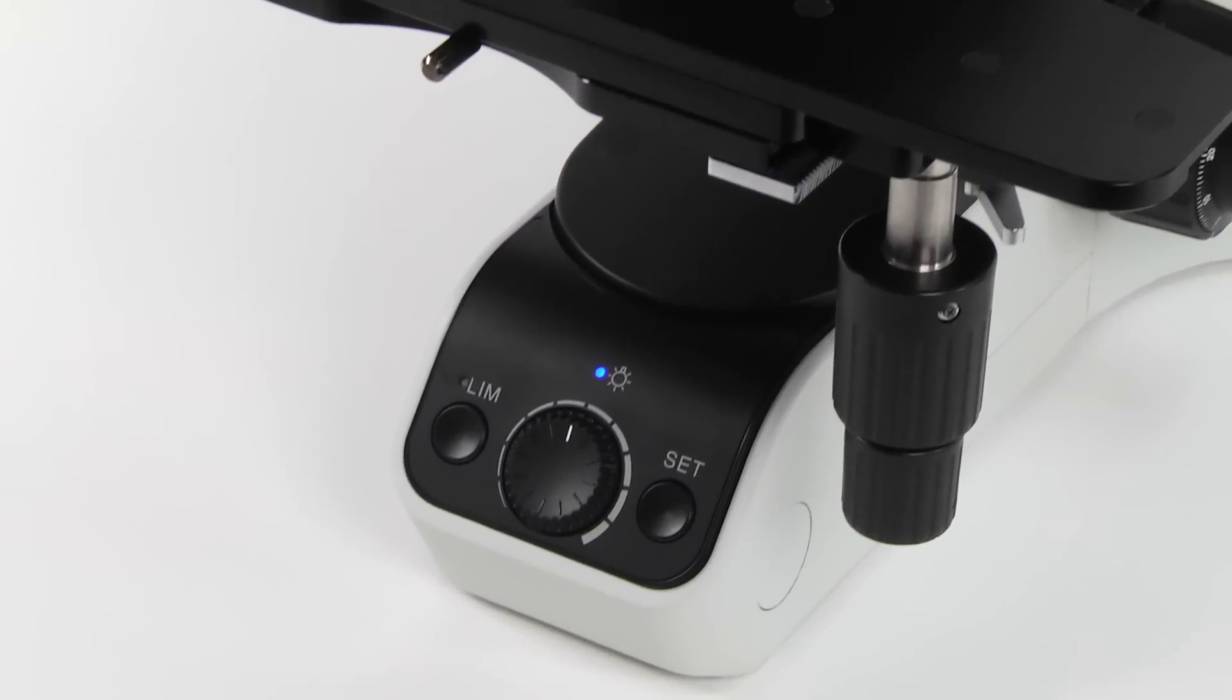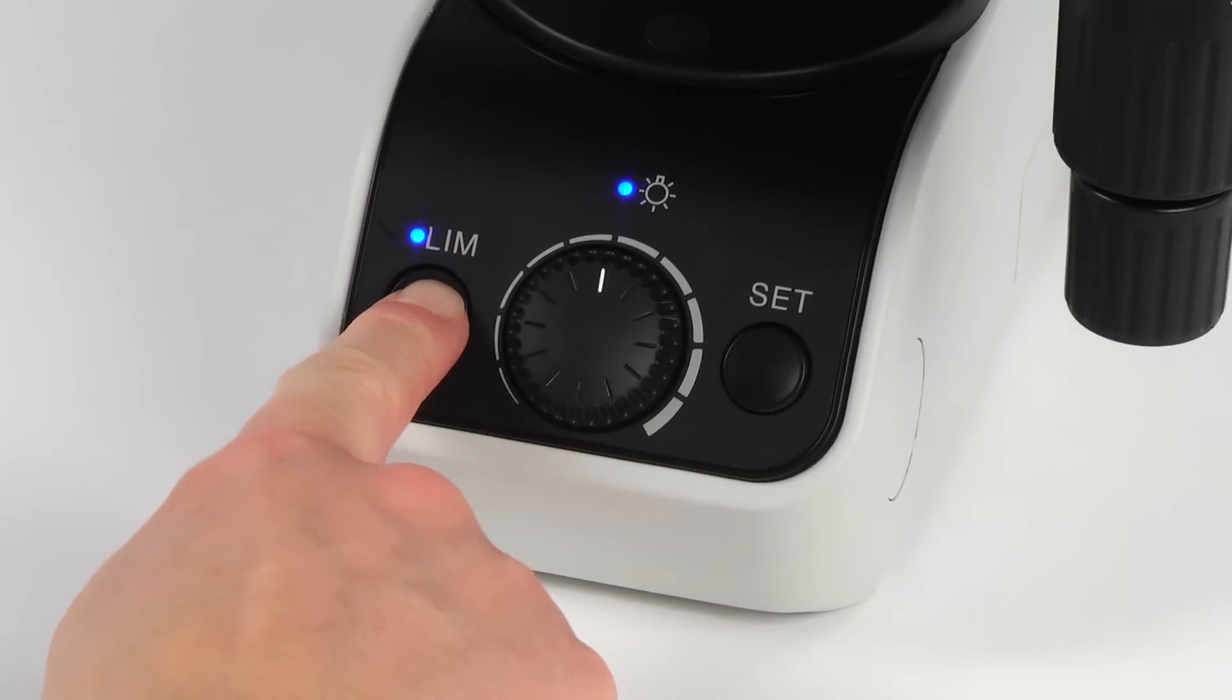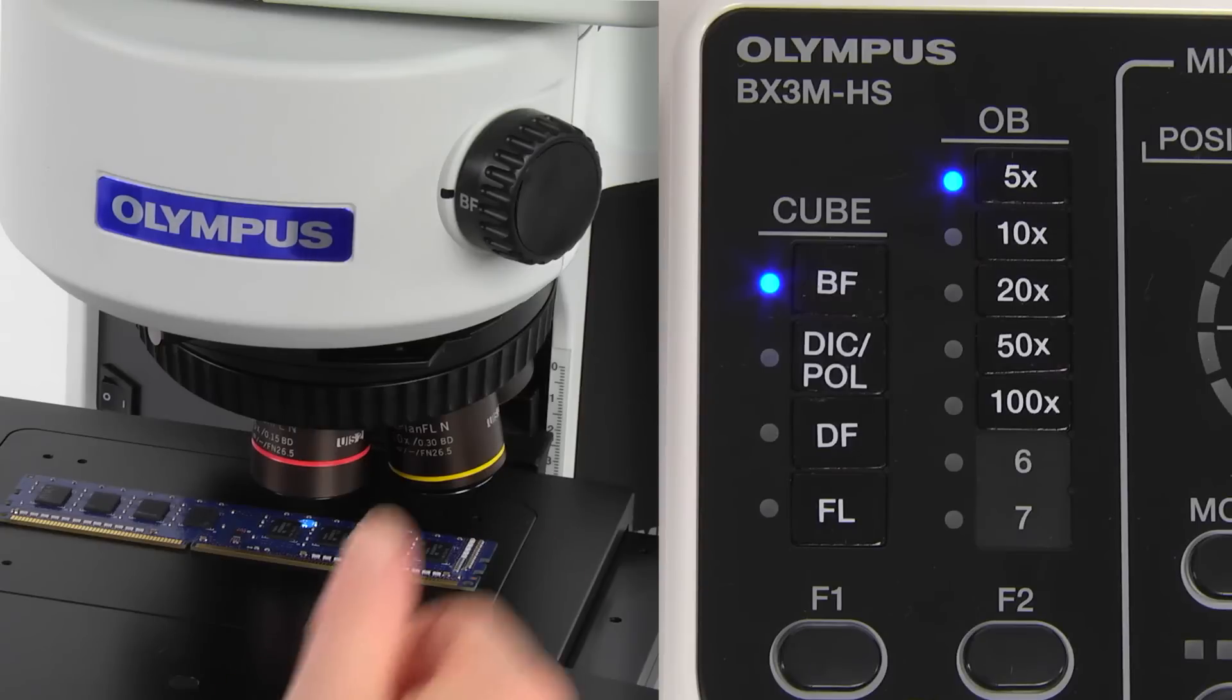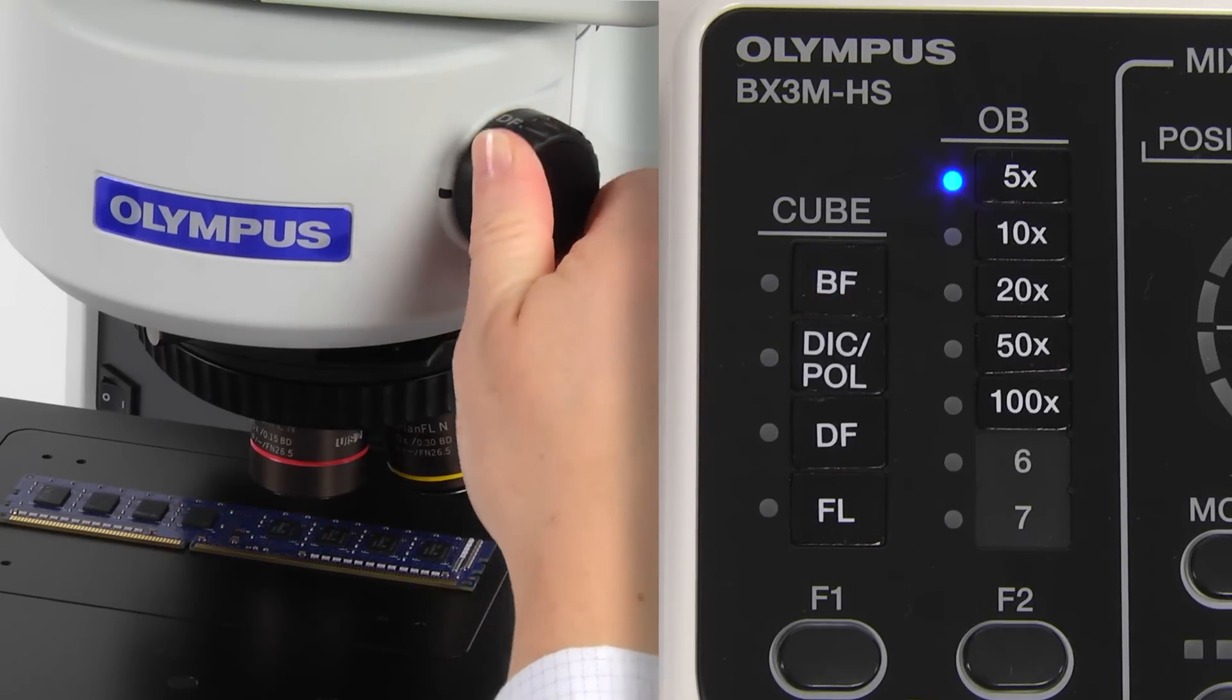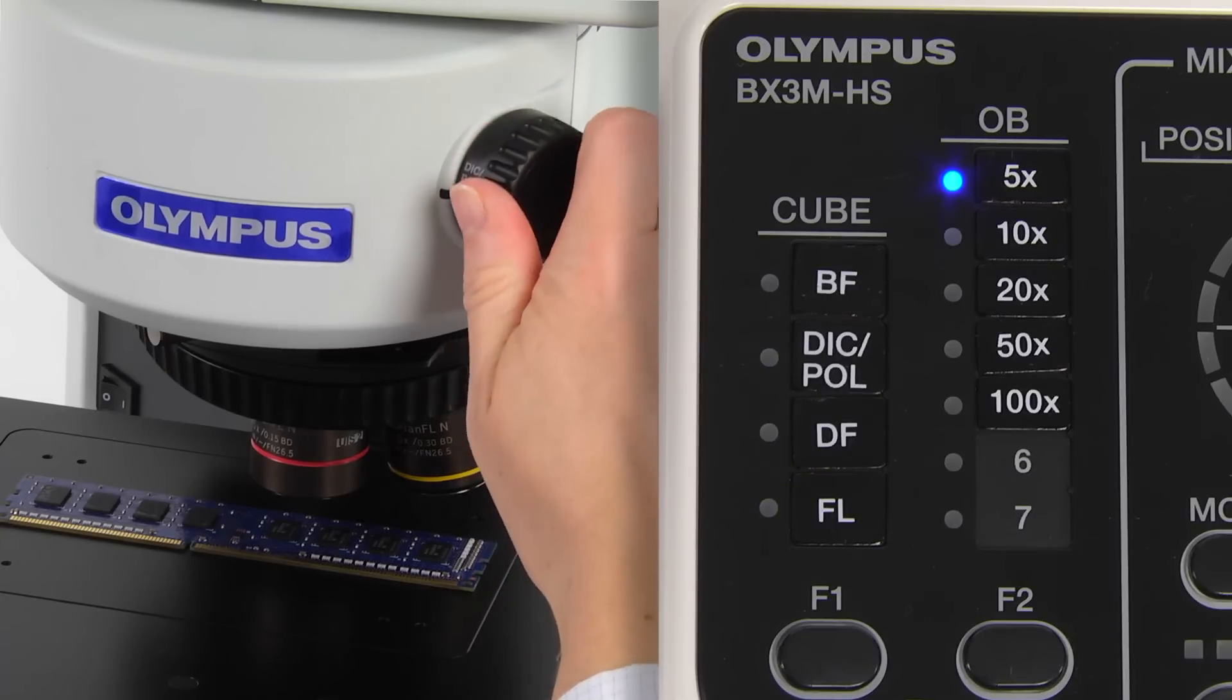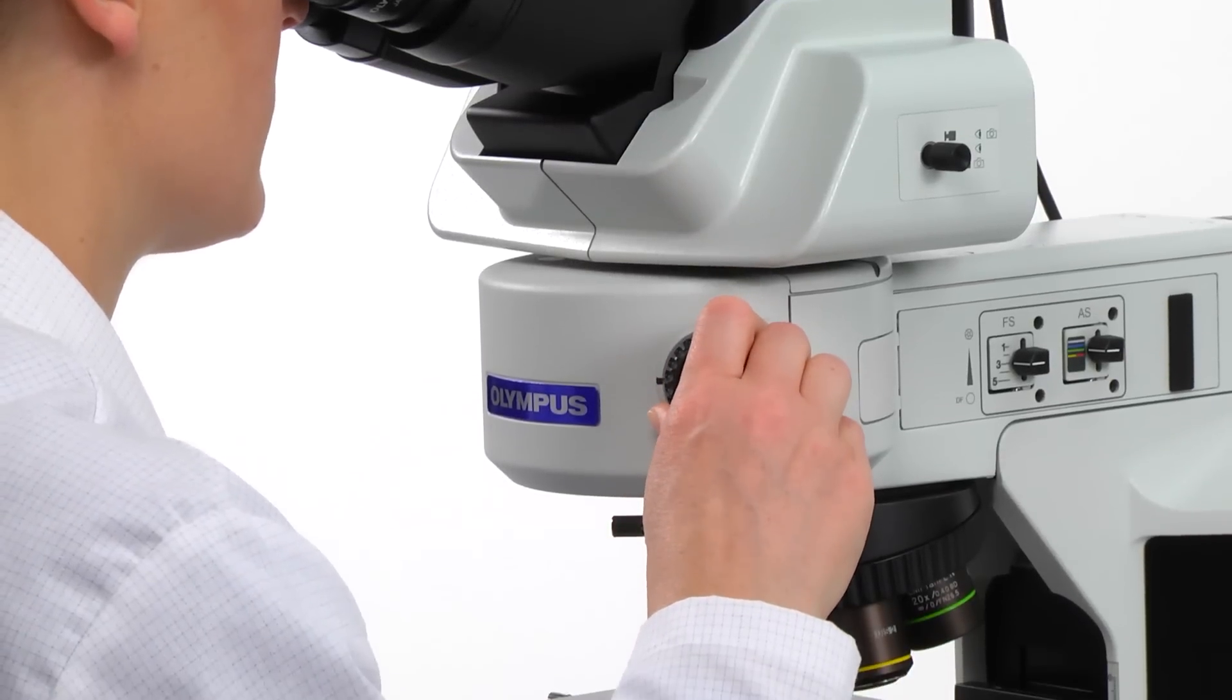For traditional observation methods, setting the illumination intensity with LightManager saves time and minimizes operator training. LightManager works with coded hardware by adjusting the illumination intensity to preset values when the magnification and observation method are changed. This takes the guesswork out of optimizing the lighting.